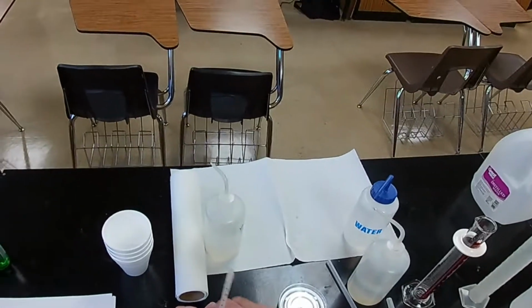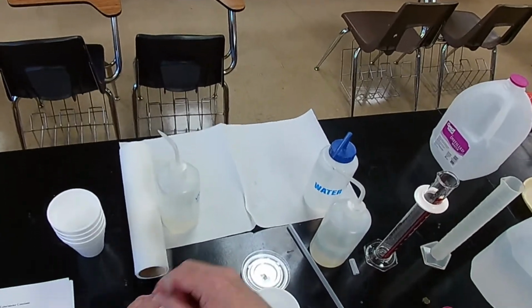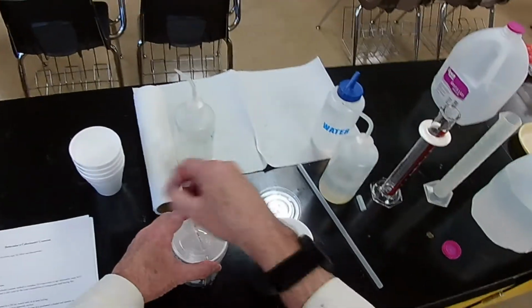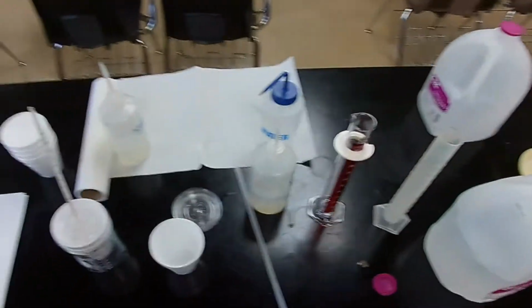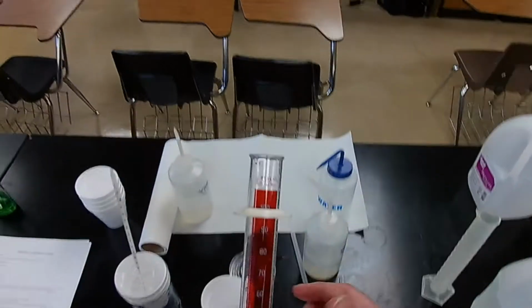Now this is the initial temperature of the cold water. And we stir it around. And then the hot water is going to go in this styrofoam cup. We're going to measure it in here, but this is at room temperature.